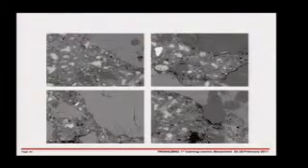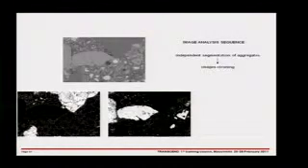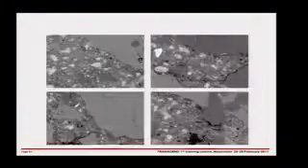So here we see 4 images from the same sample. We also see another part of the problem, that in most cases our aggregates don't just have one grey level, they have several grey levels. They may contain 3 or 4 different mineral phases. This makes it a little bit complicated, but it can be done. We can then take this aggregate here, this color aggregate here, combine them to clean them up, combine them together, and quite effectively eliminate the aggregates.